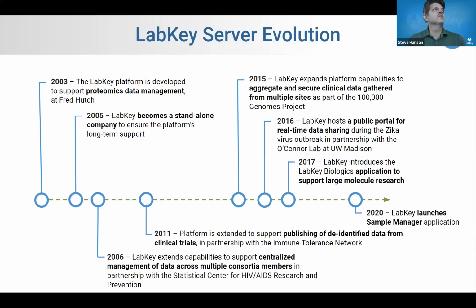These scientists are all different stripes. There are small lab scientists, big pharma scientists, and in-between academic scientists. They're all working in different domains, like biologics or drug development, lots of different domains.